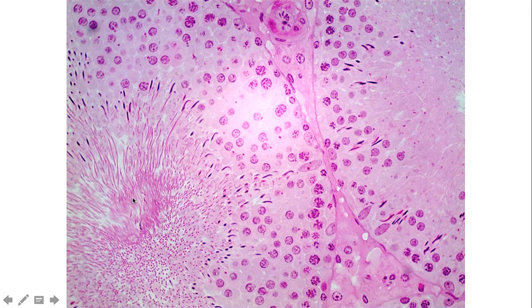And these, although they resemble the mature sperm, are still immature in terms of their ability to fertilize an egg. These cells are incapable of swimming at this point. They're going to be moving due to the pressure that's being built up as fluid is added to this lumen. So again, the cells along the outer edge here are the immature. And as you move towards the lumen, you're seeing more and more maturity. And even in the center, you're seeing these spermatozoa that are still incapable of swimming and fertilizing an egg, but they're much more mature than the original ones around the outer edge.